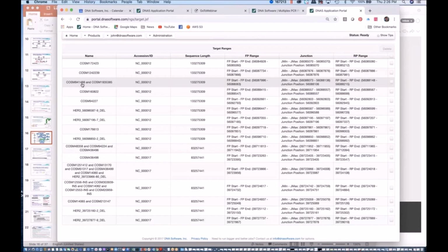So it combined this 488 mutation with the 385 mutation, for example. So 2 of them are combined here. Here there was a cluster of 8 of them. Here's a cluster of 6 of them. Insertions and deletions as well as SNPs got combined here. But it was smart and combined them all in this intelligent way.